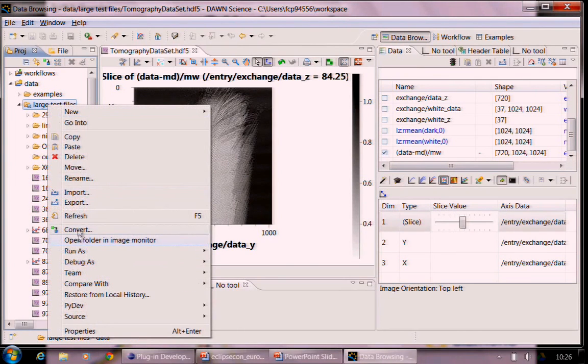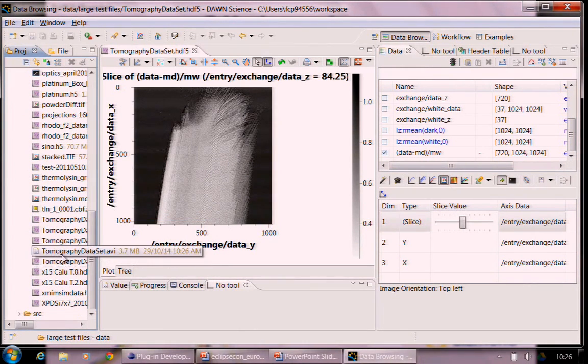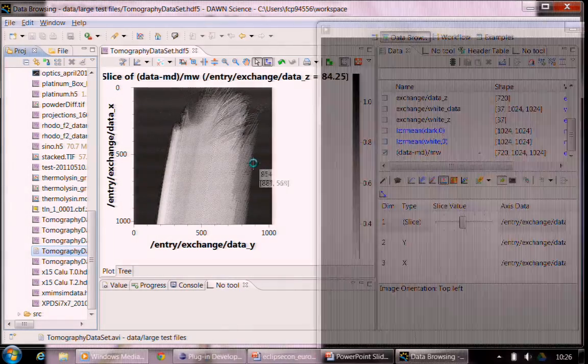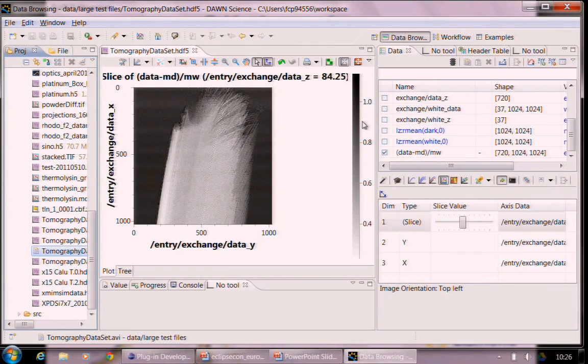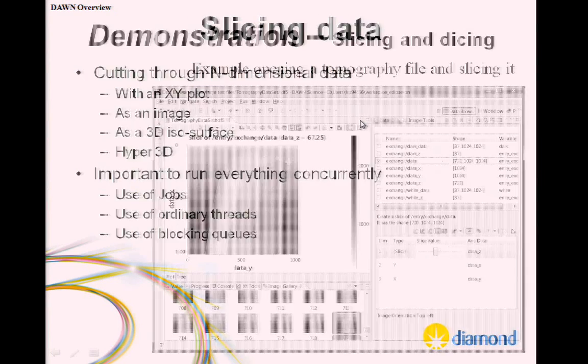I think probably it still writes a valid file, but obviously, it hasn't done the whole stack. So we'll try and look at some of those tools now.